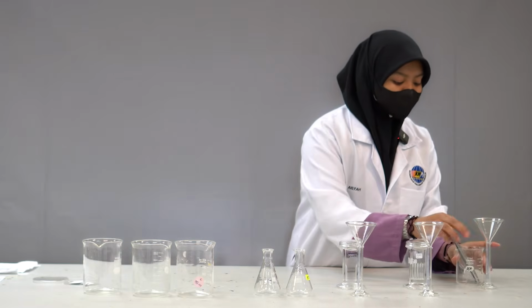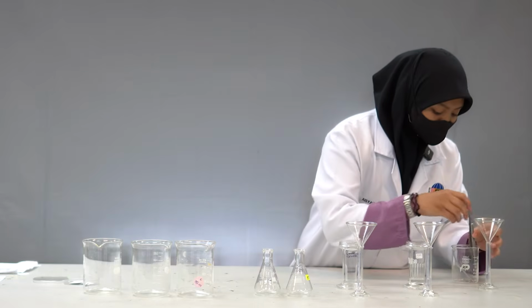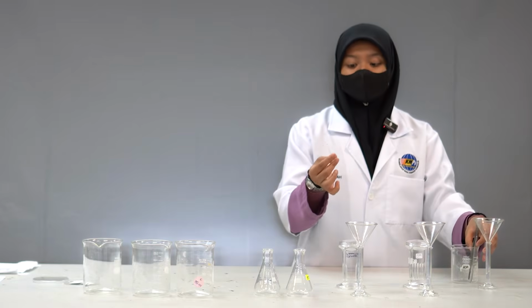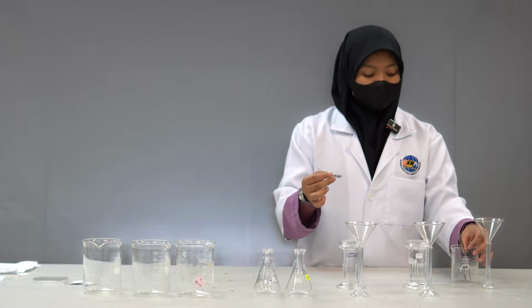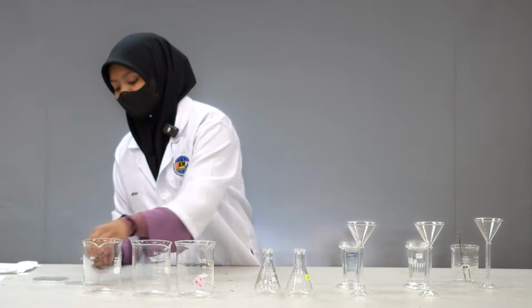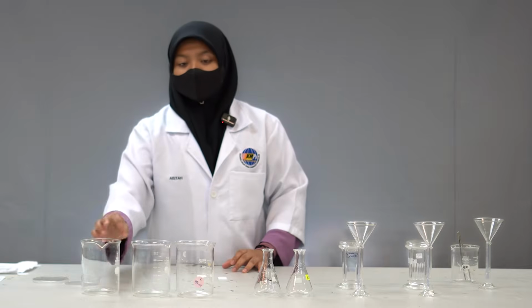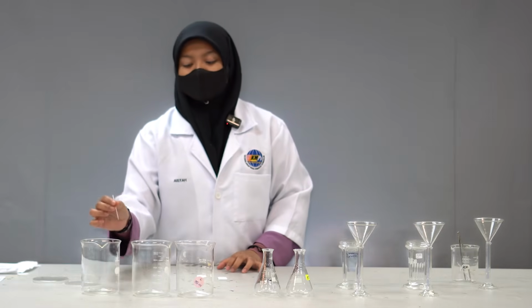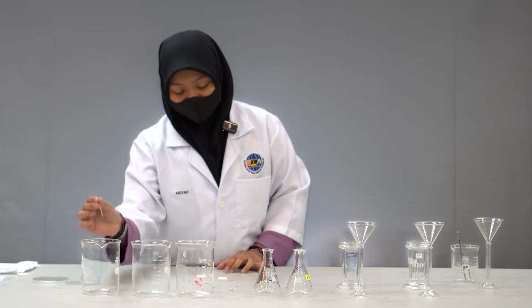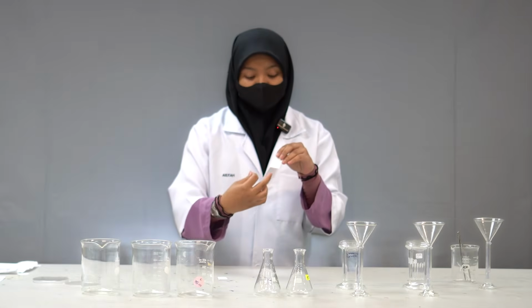So this is the capillary tube. We have 3 capillary tubes, and you take these 2 thin layer plates. I start with the acid. We dip the capillary tube into the solution of acid. As you remember, we labeled the sections A, B, and N: acid, base, and neutral.